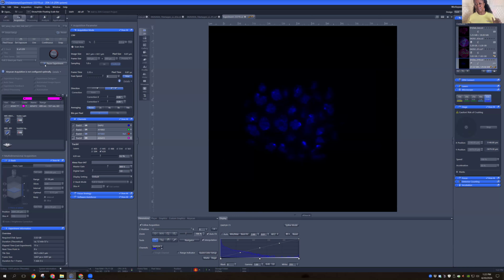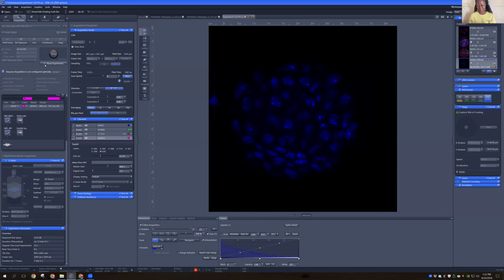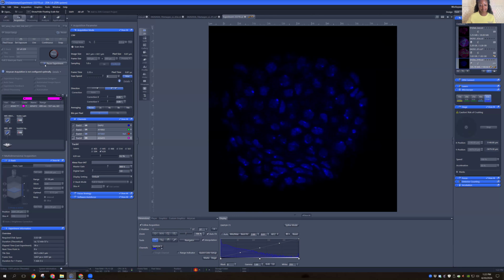So as we're waiting for this acquisition, and I love this, as Raja's already pointed out, some comparisons to astronomical imaging, and this, of course, is another one, waiting for the image to actually be fully acquired, so you have a bit of downtime. So could you talk about the process of learning how to use such a complex piece of machinery?